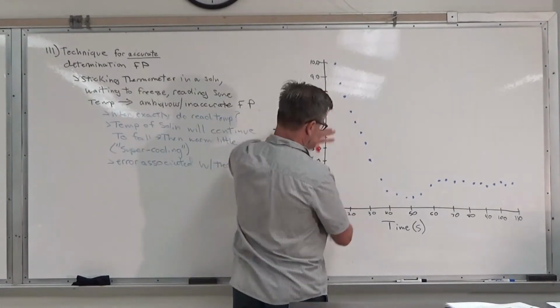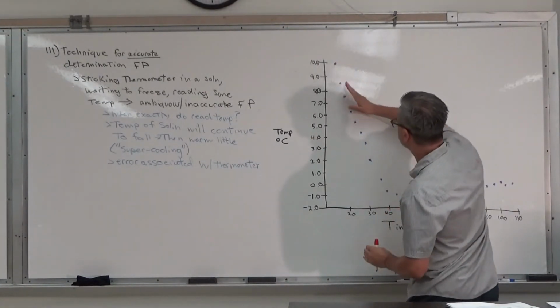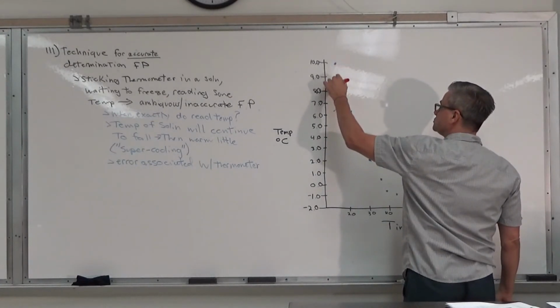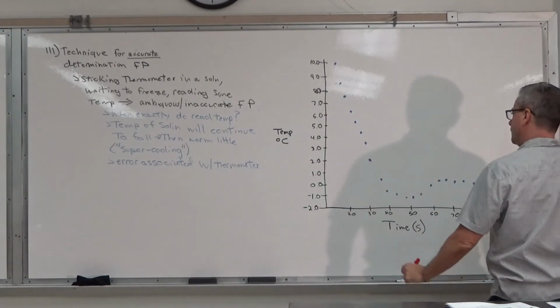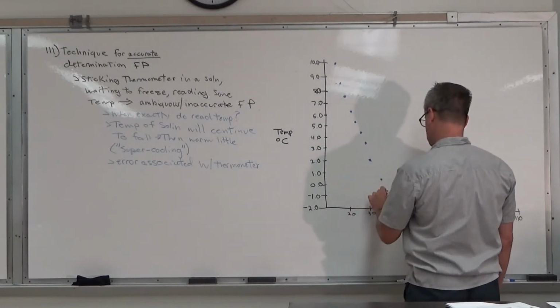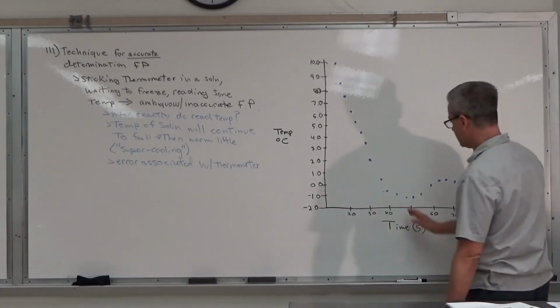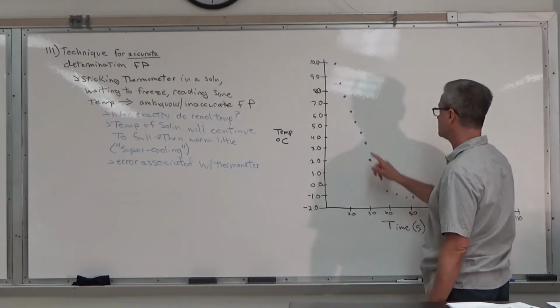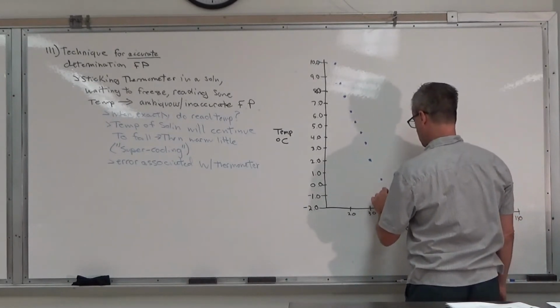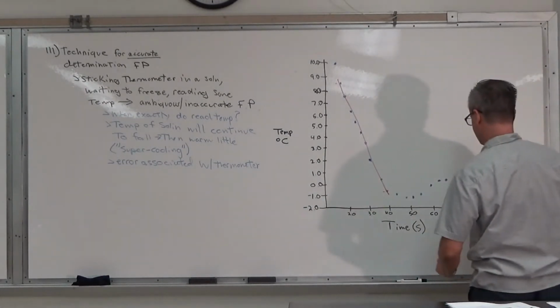So what you're going to have to do is look at it and decide which part of the data is pretty linear. It kind of dips a little bit here, so maybe I won't use that data point. Maybe I'll just start with this one, and I'll go to, say, this one. Then I'll tell Excel, generate a trend line for just the data in between those two points. It will generate a straight line, which I of course did not do.